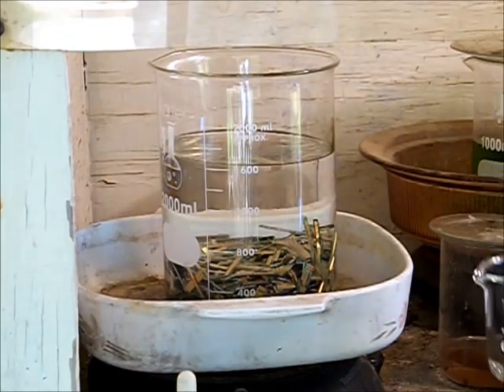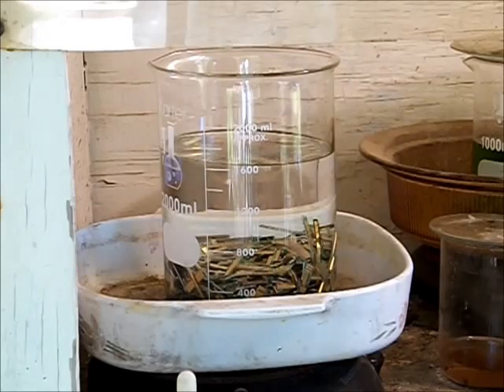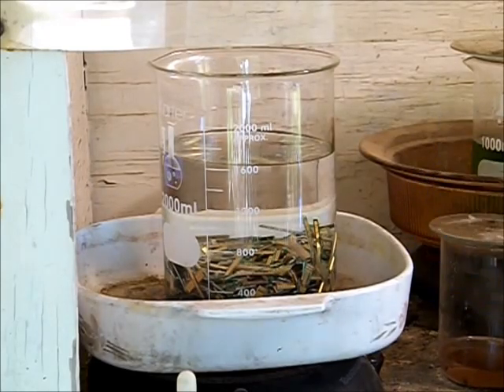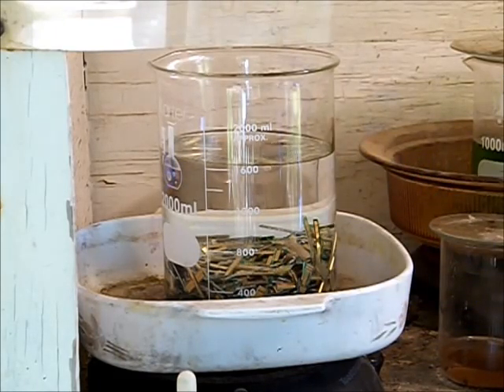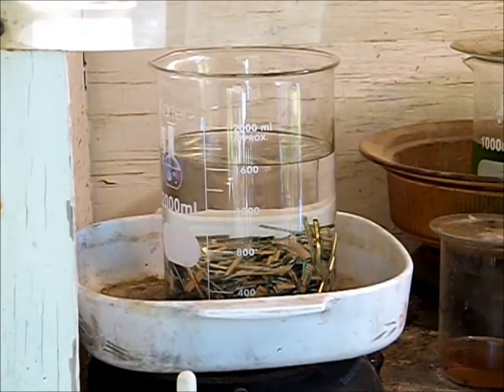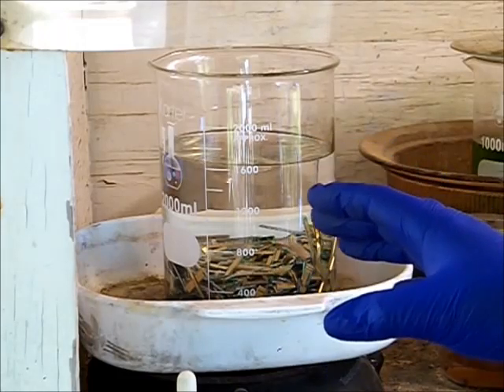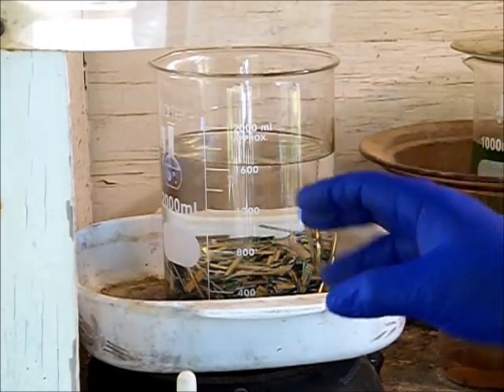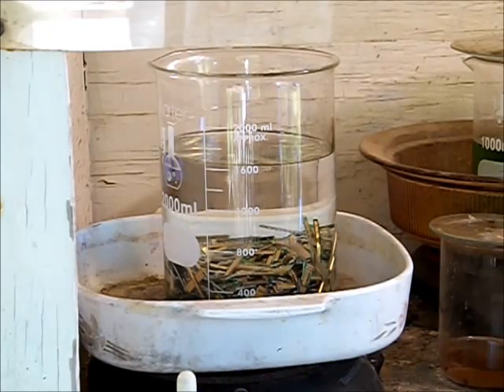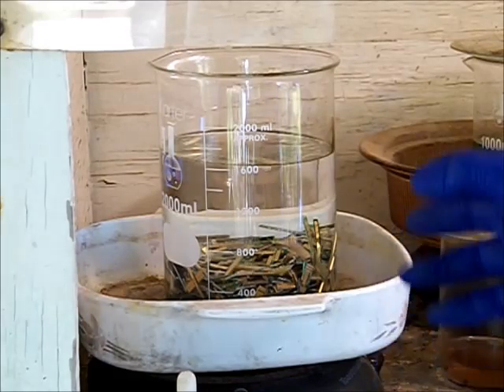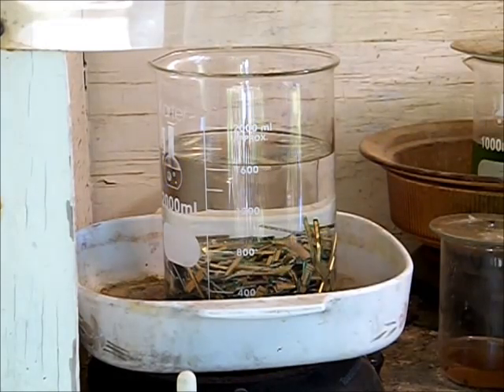Depending on what may be in your material, you may see a reaction start, but it's not actually dissolving anything. If it's got some lead solder in there or something like that, the sulfuric acid will react to the lead. Dilute sulfuric acid causes a little bit of a reaction, but it's just a superficial reaction making a few bubbles.